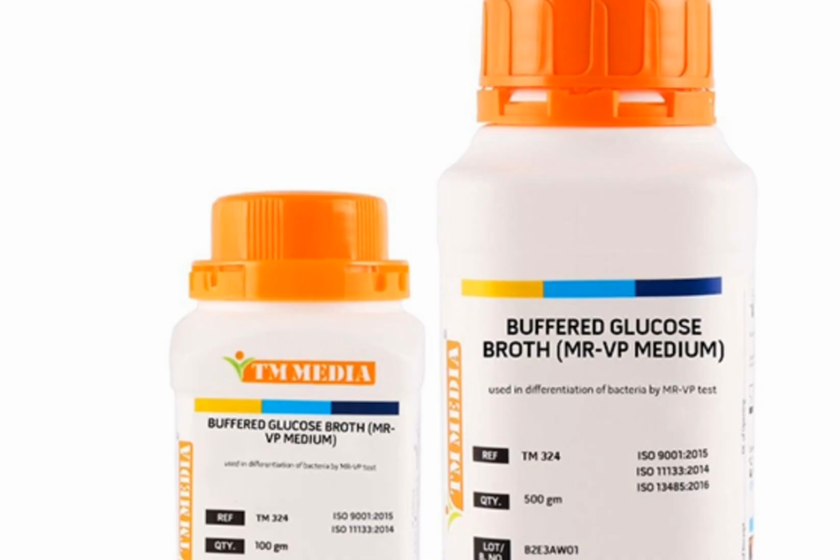And as usual, like I said in the instance of the methyl red test, we produce a broth which we call methyl red VP broth. So this broth is produced, and then we use it to run both the methyl red test and the VP test. So in this instance now, we are limiting ourselves to the VP test, that's the Voges-Proskauer test. We are looking at all the different processes that happen in the VP test, and this is very, very important for us to know. Now, what's the procedure?